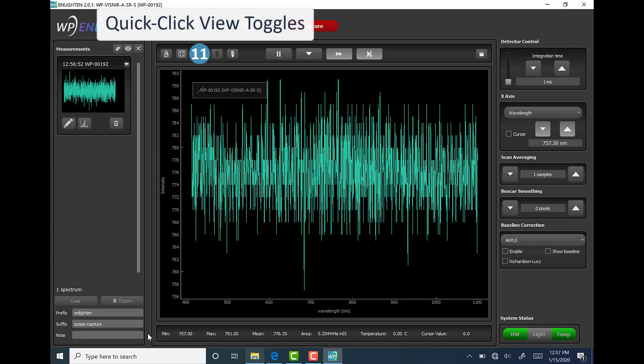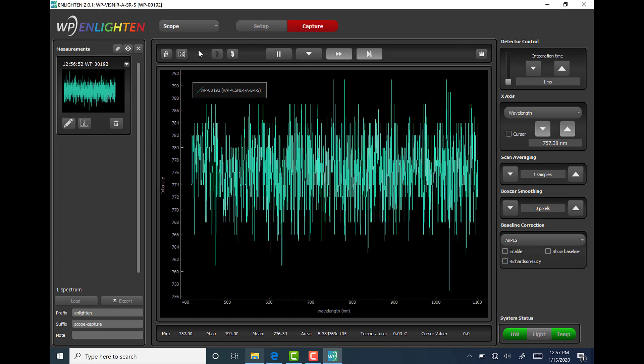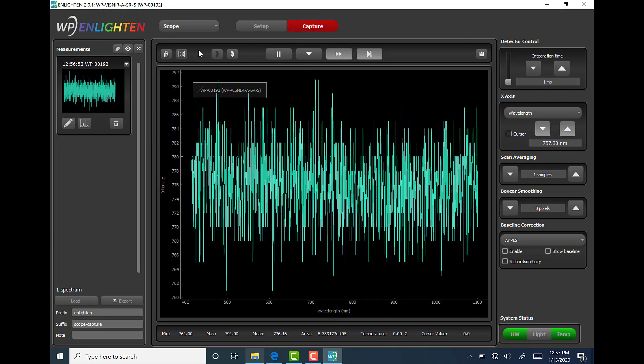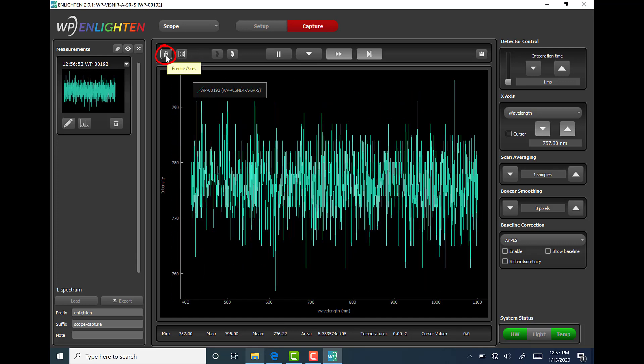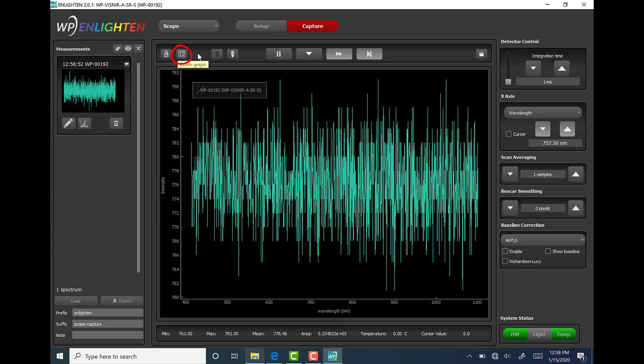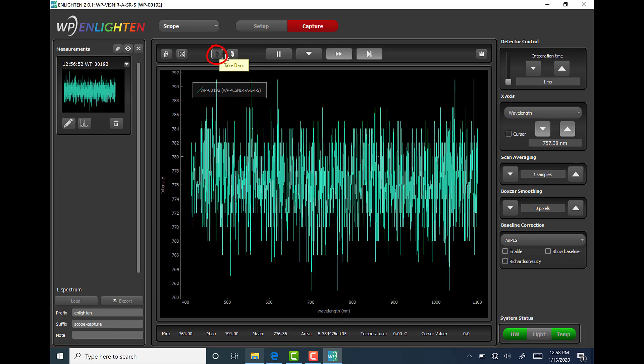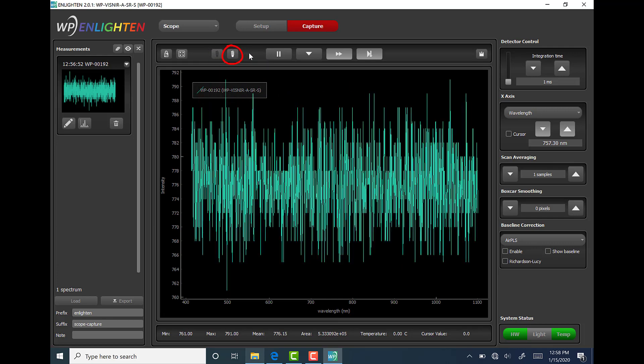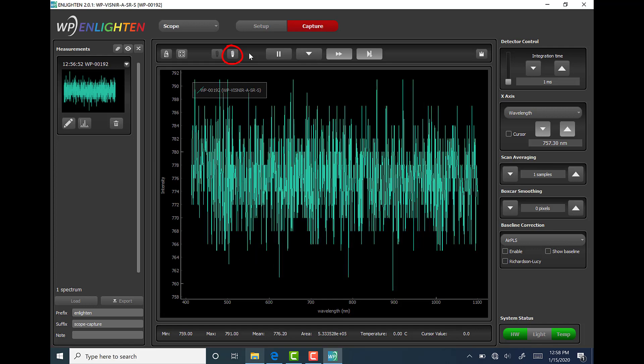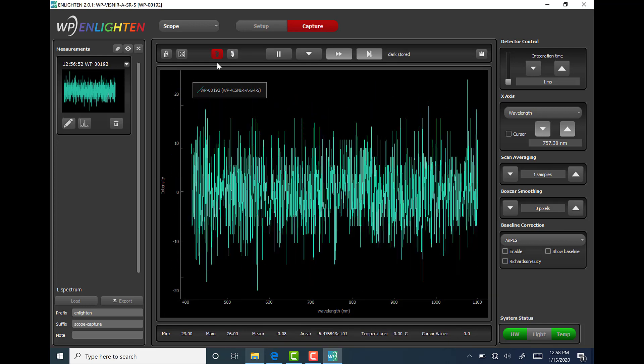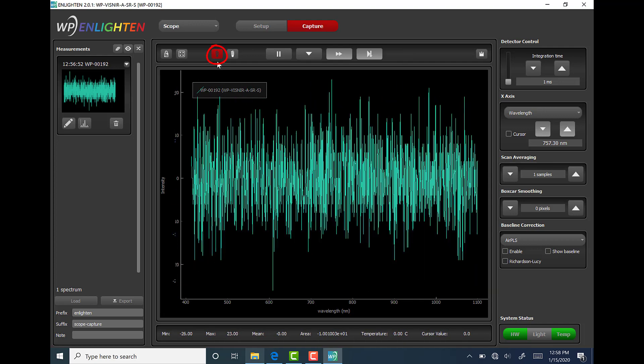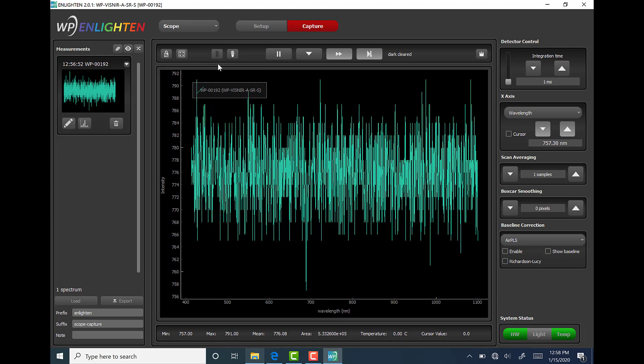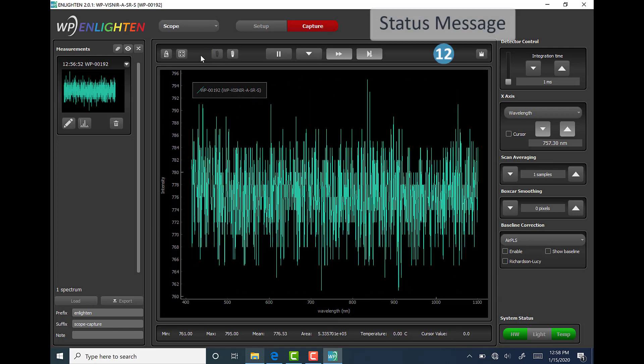Area number 11 is quick click view toggles found in the upper left corner above the spectrum chart. Here the user will find buttons to lock and unlock the y-axis, zoom in and out to full width chart mode, store and or clear a quick dark measurement, and store and or clear a quick reference measurement. If a dark or reference measurement have been stored, then the icon will turn red to signify this. To clear a stored dark or reference, simply click the corresponding red icon until it turns back to its original color.